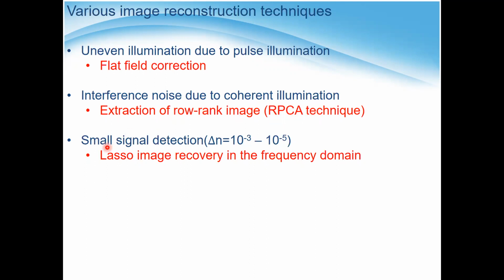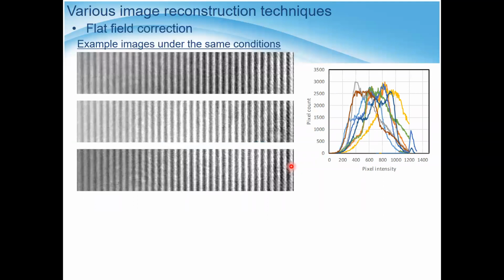And also we had to detect a very small signal, a very small refractive index change. In this case, LASSO image recovery was very helpful. LASSO is a kind of enhancement of some specific feature in the data or image. In our case, we can use a spatial frequency domain technique. So I'm going through these step by step.